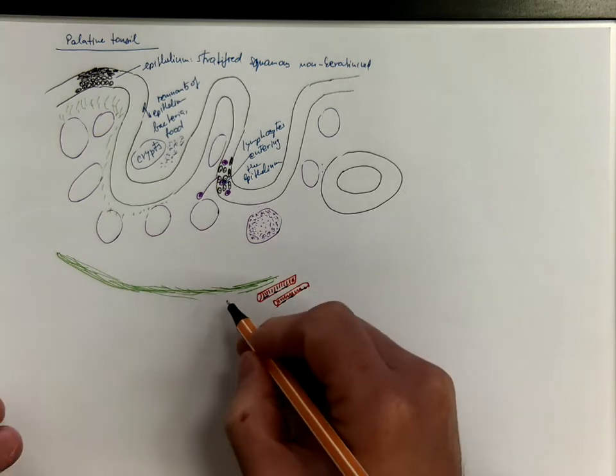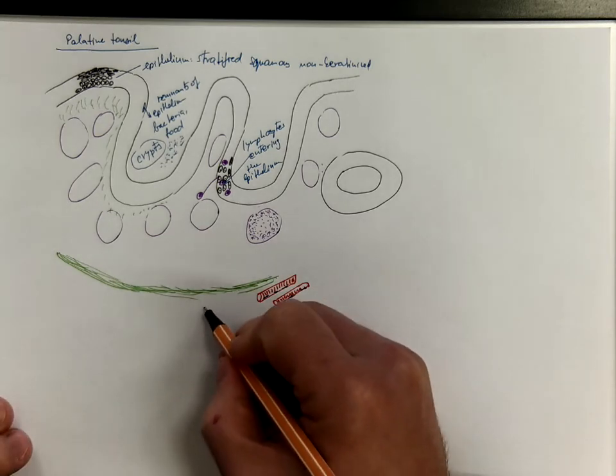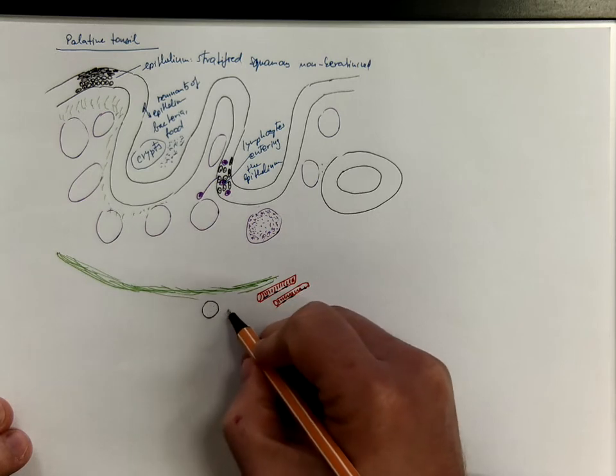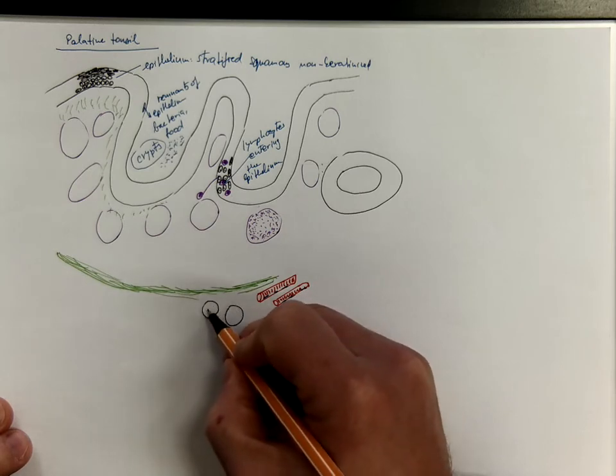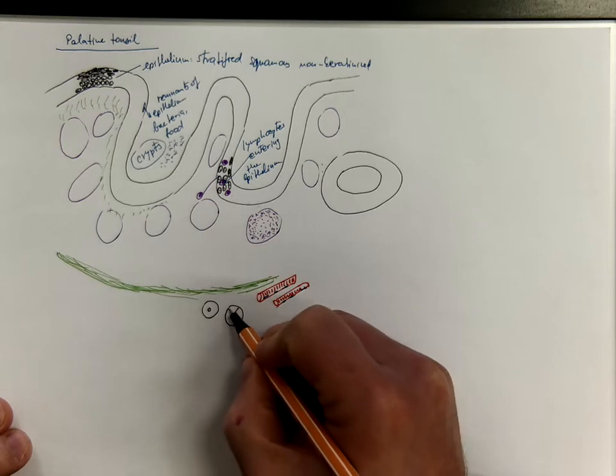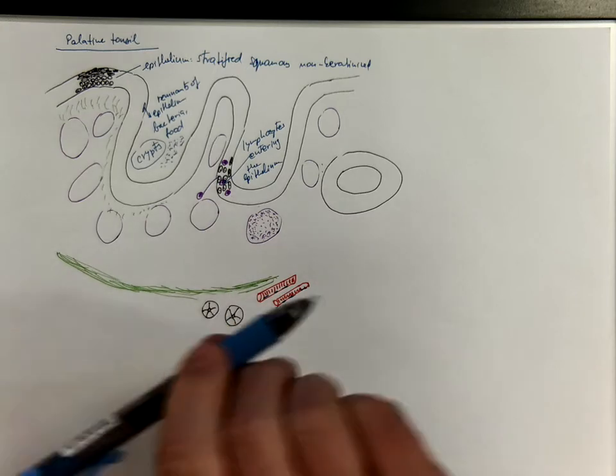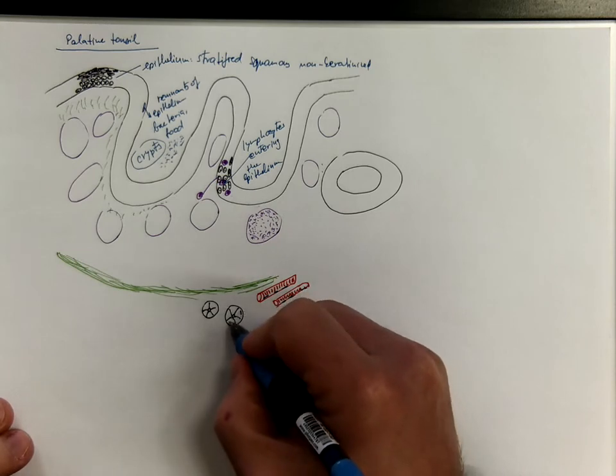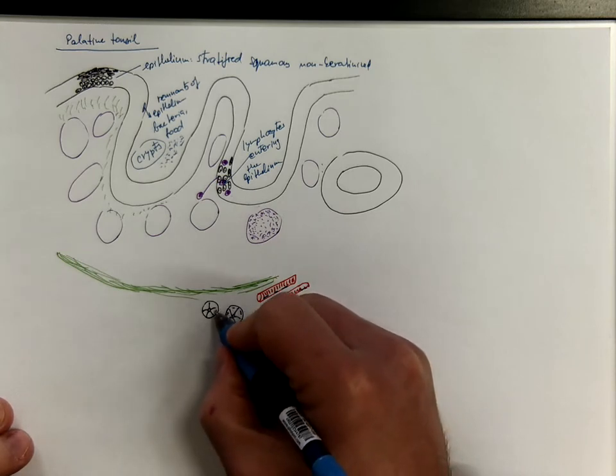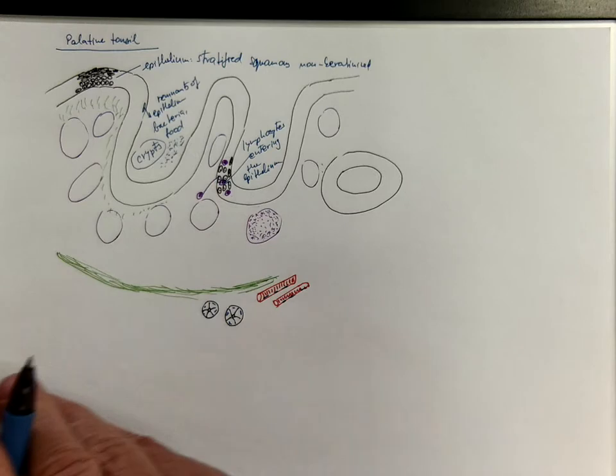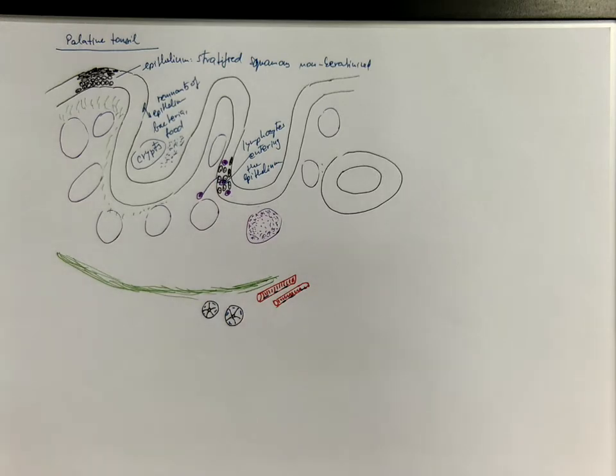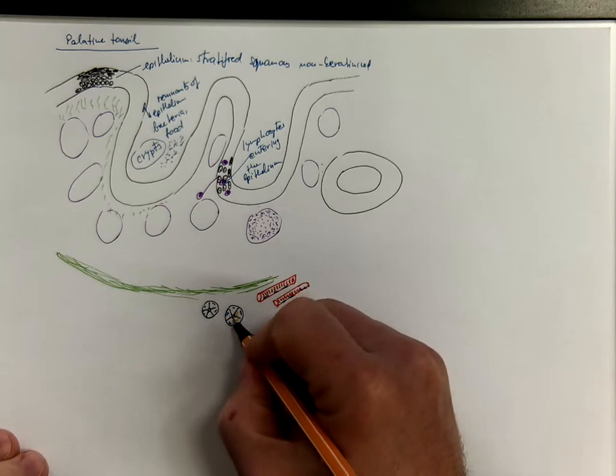And as part of the soft palate there are also mucous glands present to them, including a couple of mucous tubules with their compressed nuclei and cytoplasm filled with pale mucus.